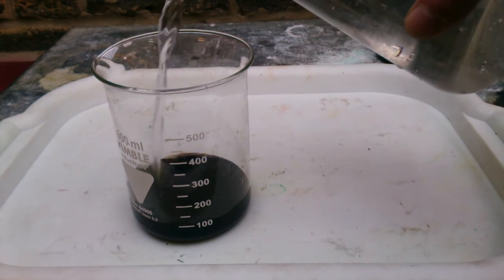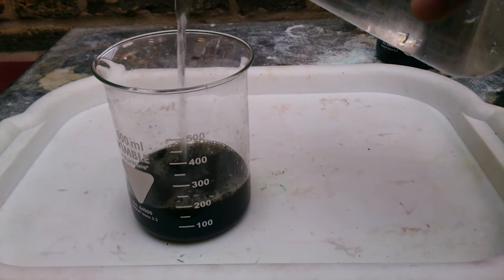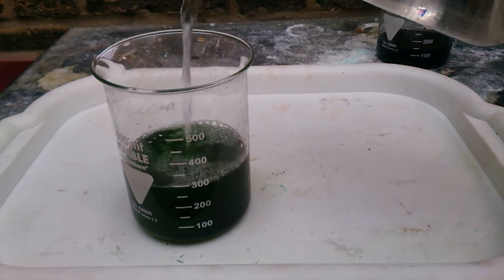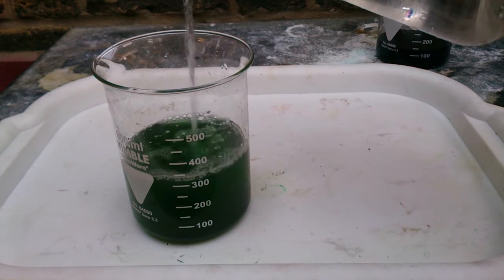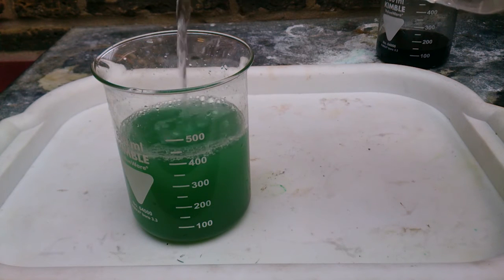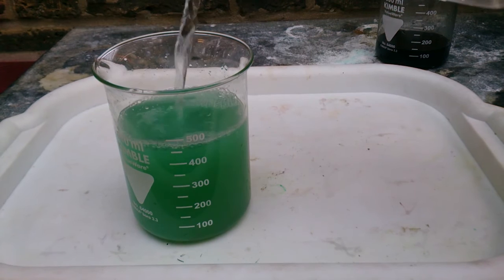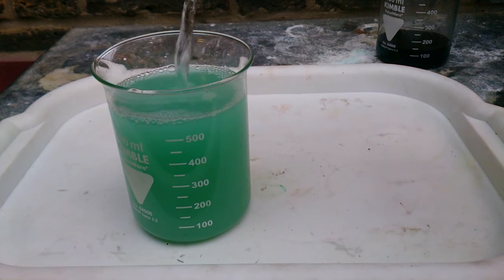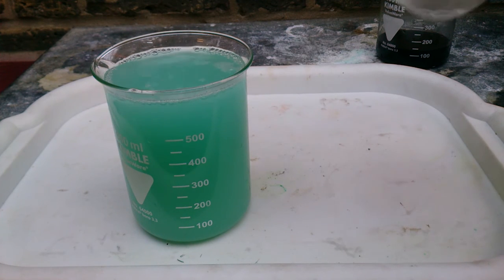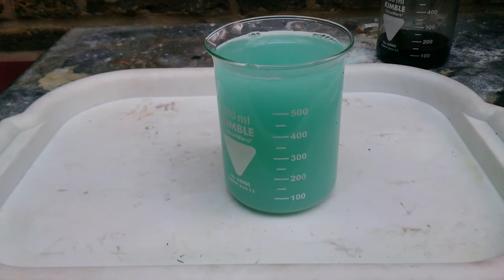Let's have a look at what will happen if we dilute our solution. As you can see, it will get lighter and lighter, and finally some milky precipitate will form. This is happening because copper chloride 1 is quite soluble in hydrochloric acid, but not soluble in water. So the precipitate you see is copper chloride 1.